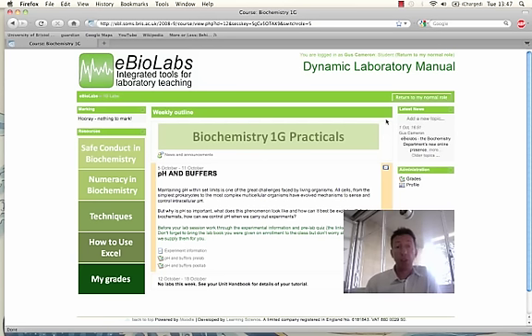So our student numbers have increased, but our unit resources remain the same. There's a huge marking and administrative burden associated with running practicals, and they're becoming increasingly facile and cookbook-like. So we wanted to change that, and we recognised that the key to doing that was to increase the amount of preparation that the students do before they get to the lab and reduce the amount of administrative and marking work that had to be done by staff.